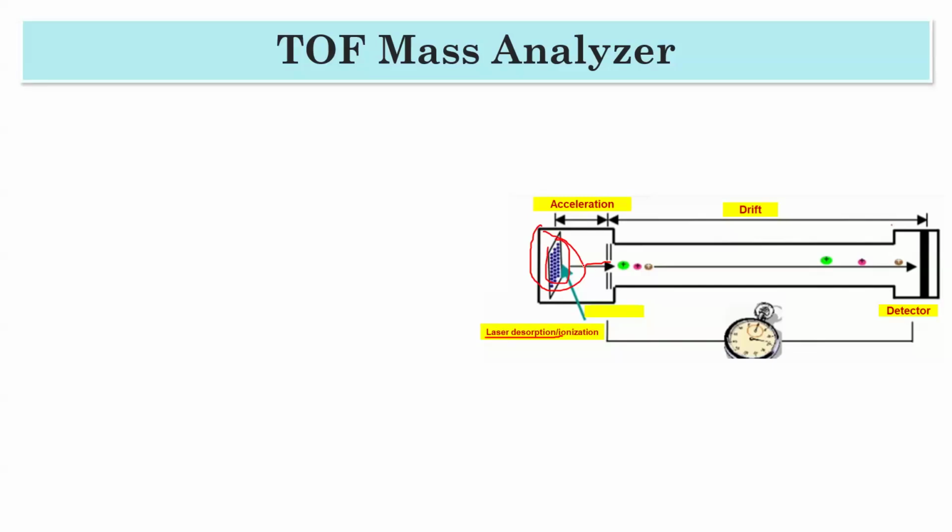Then that ionized molecule is moving inside. In TOF, a time of flight mass analyzer, you have some free space where the ionized molecule will move.